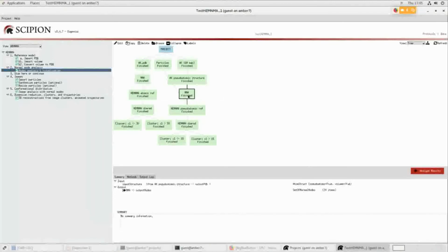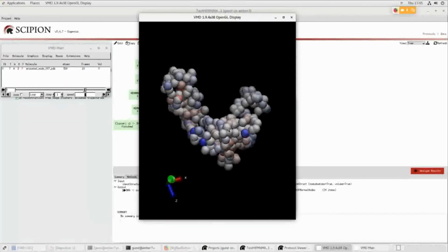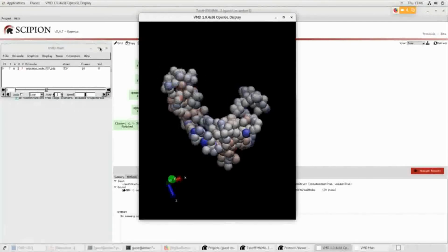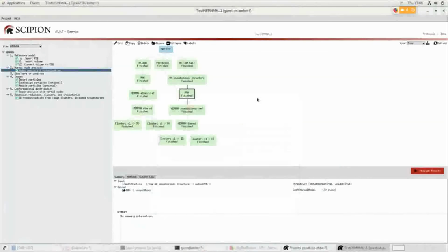And so you get very similar movements if you look at the pseudoatomic structures. I didn't actually show you how we got it, but these movies for the pseudoatoms are very similar. The modes are very similar. So basically you have the same visualization of these normal modes, but I skipped this step.